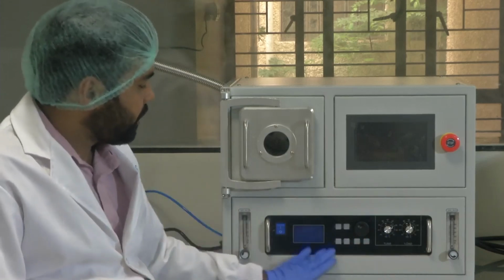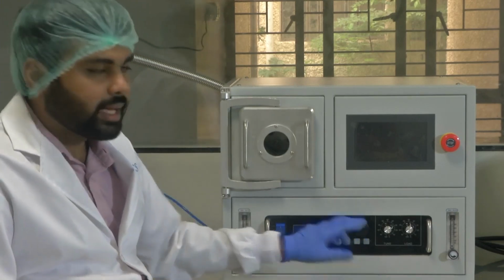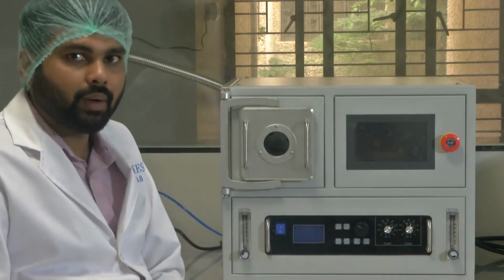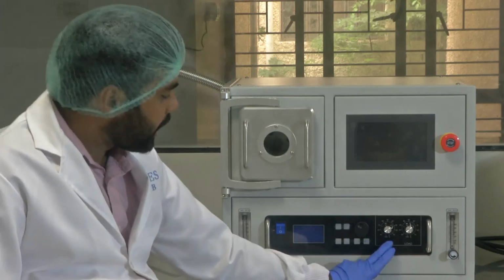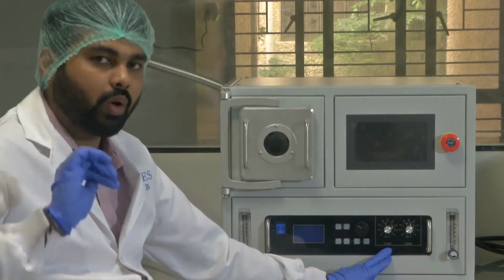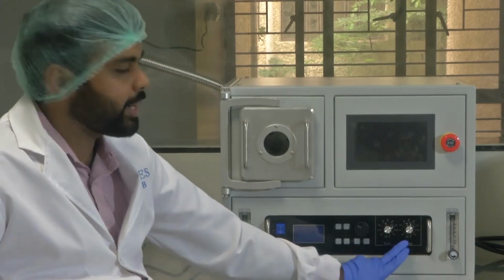Okay, now this is the RF control. I told you, right? Separately, if you want to switch on the RF, you have to power it on here, and you can set the RF power, the power that you want to give, through this knob. And I told you that the return power has to be minimized. Only the forward power has to be maximized. That return power minimization is done through this tune and load.